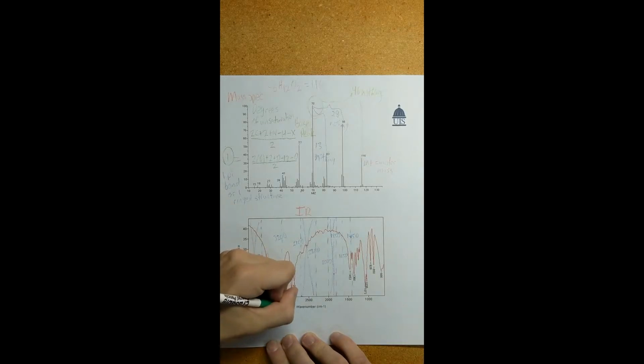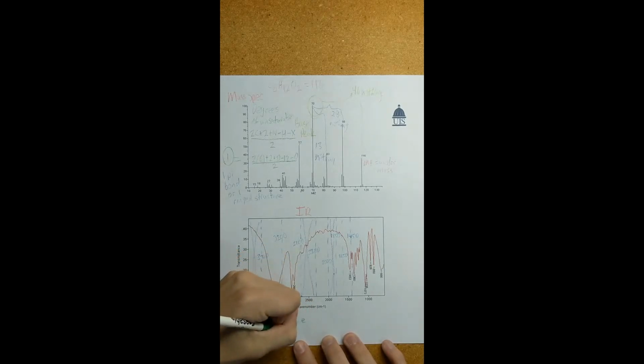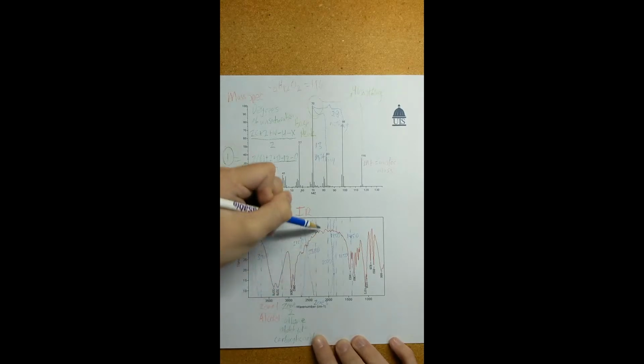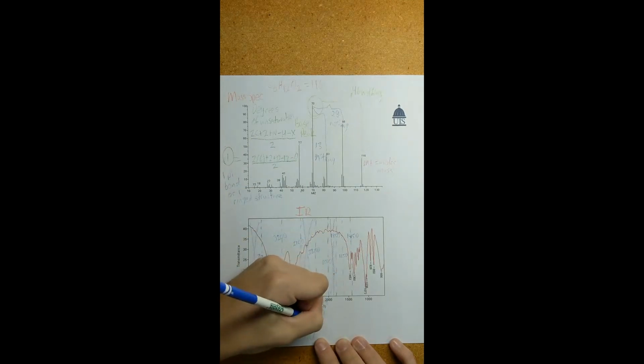In zone 2, we also have nice peaks to show. There's a couple more possibilities here, such as an alkane, an aldehyde, and even a carboxylic acid. Zone 3, we have near no peak or peaks here. This is a very high signal, so we're just going to label this as no signal.